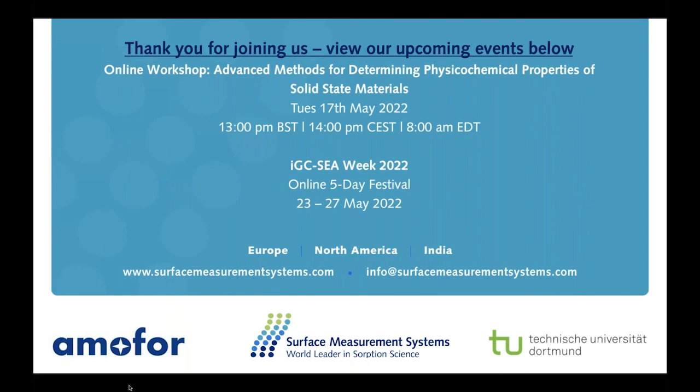But when it comes to really, really fine materials, you would still expect the higher surface energy, so stuff with really high exposed facets, to have those same kind of dissolution rates. But I'm not sure that would be expected from a sample that perhaps isn't as soluble in a certain solution. So different types of experiments in a range of different solvents may yield the kind of relationship that you're looking for. Yeah. Okay, thank you very much.